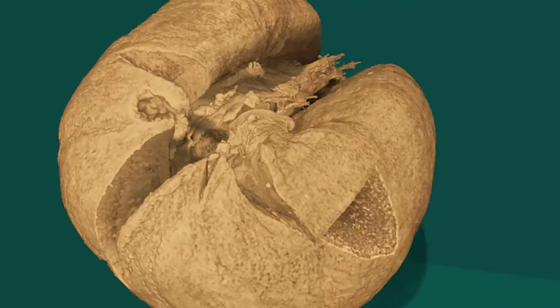In the food industry, things that we might buy in a supermarket—we have a number of customers in the food area who get important information about the structure and porosity of food products.